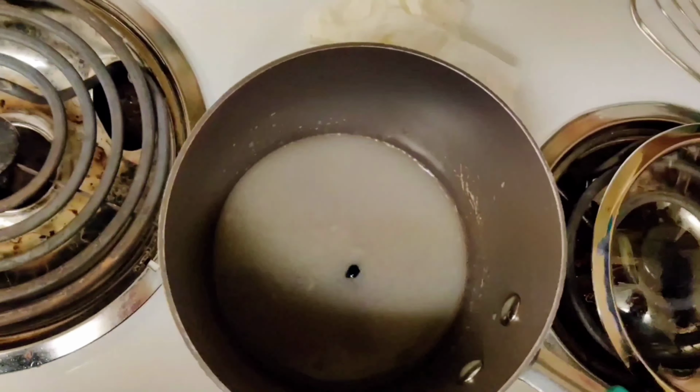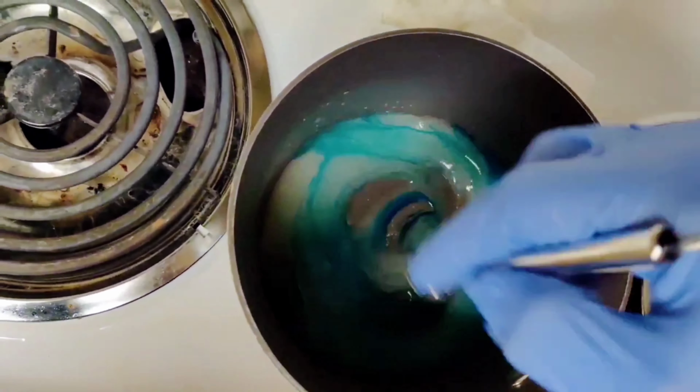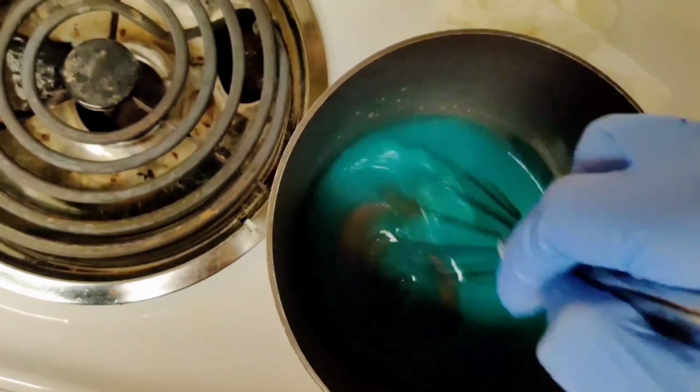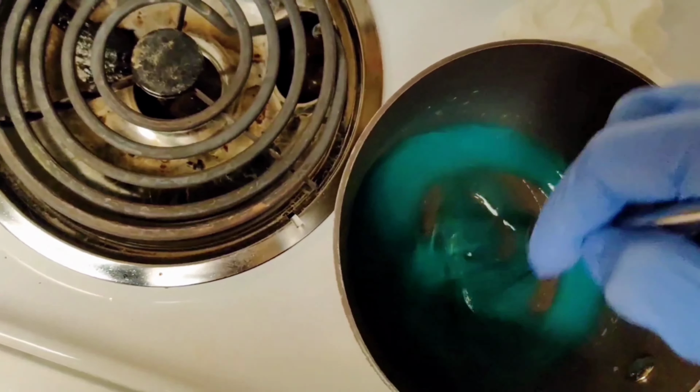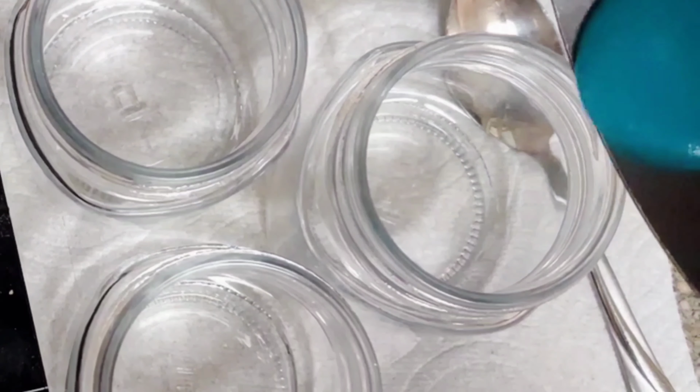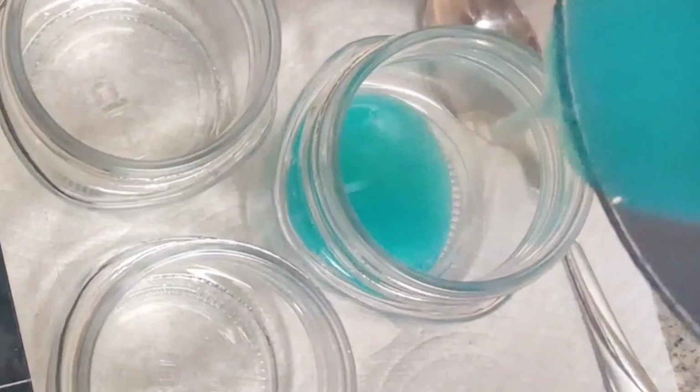At this point, I add food coloring. I'm using blue, but any dark color works. Dark colors are best for seeing the growth of the mycelium, plus other contaminants stand out as well. Now that it's thick and kind of waxy looking, I will pour a thin layer in each jar.